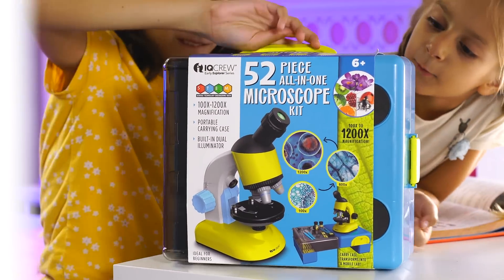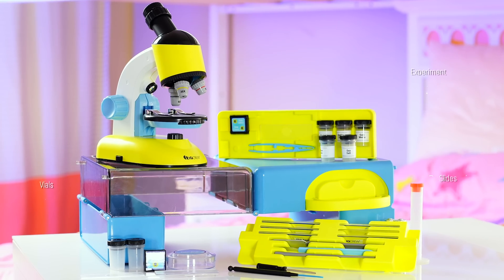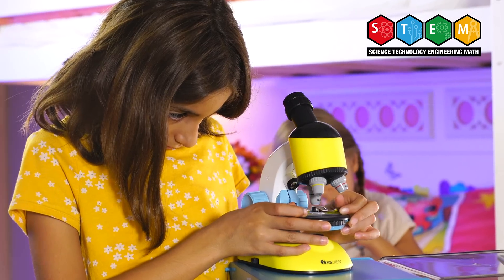This comprehensive kit includes tools, vials, prepared slides, ready-made experiments, and much more. Everything kids need for hours of enriching fun, all neatly packed in a durable carrying case that doubles as a mobile lab table for maximum portability.